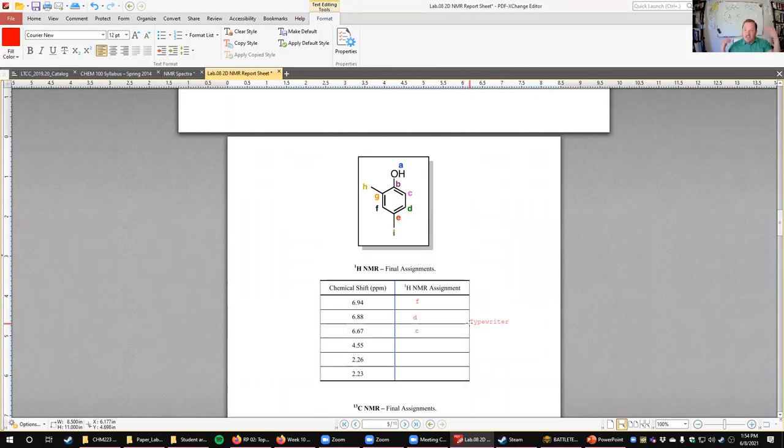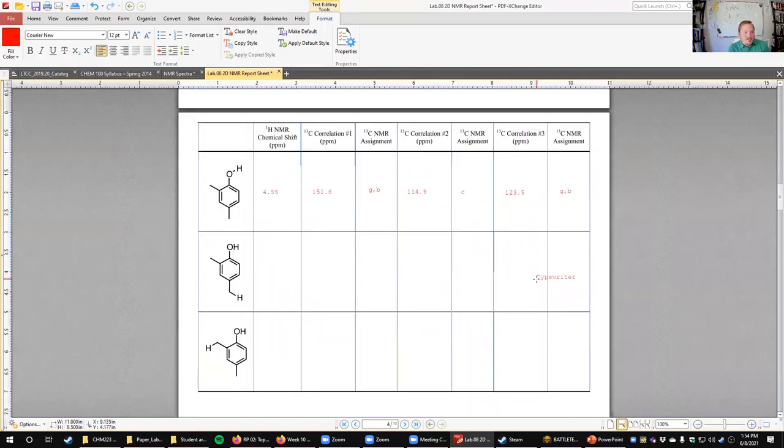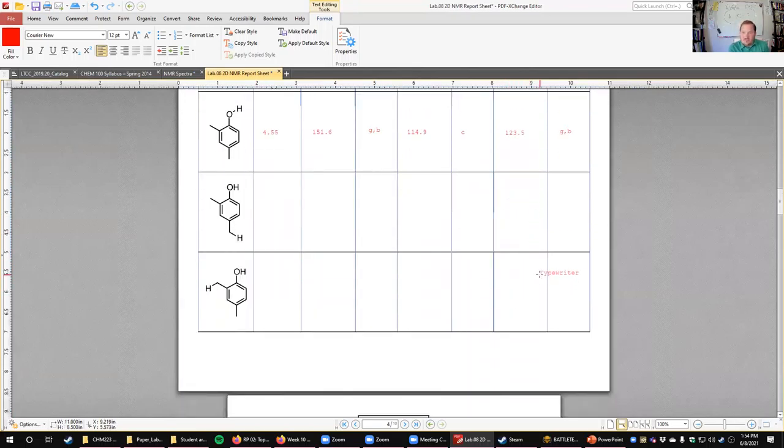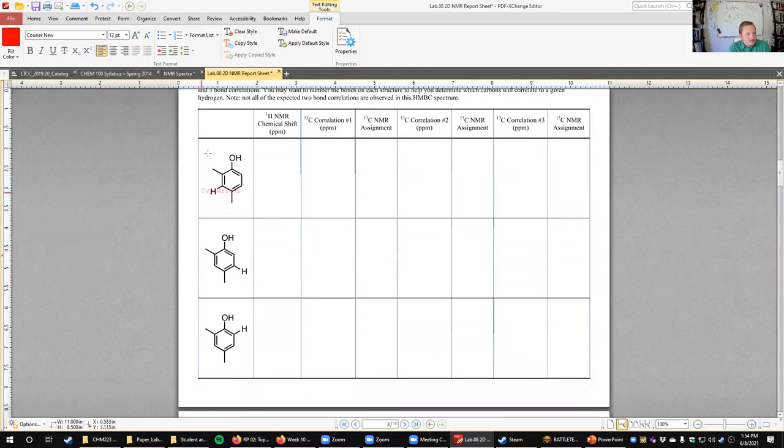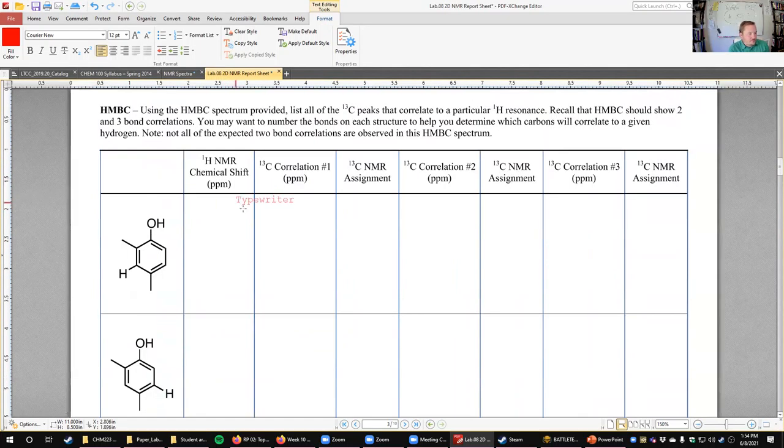And so you see how we didn't actually get to being able to do much of that assigning until we got to the very end. All we did was we kept lists of possibilities. And then at the end, you cross-reference those lists and use them to cancel each other out, basically. Anytime your list of possibilities for a signal doesn't match another list of possibilities, anything that doesn't show up on both of those lists, you can cross off because it has to satisfy all of this criteria.